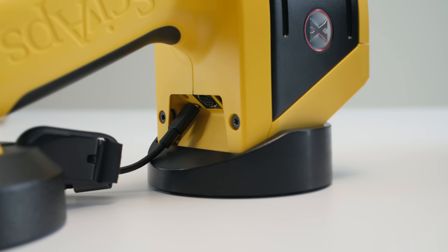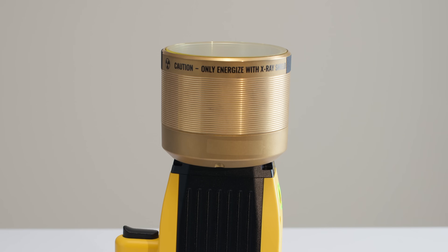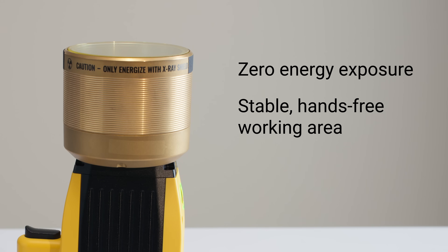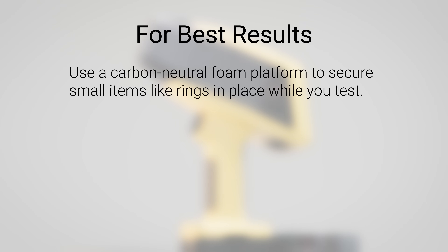To view the results, you can either take apart the dock and barrel, or — what I recommend — connect to a computer. This kit has an extra layer of safety by giving you 100% confidence of zero energy exposure, while also giving you a stable, hands-free working area. Use a carbon-neutral foam platform to secure small items like rings while you test.